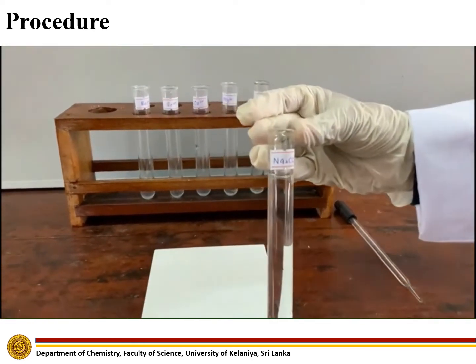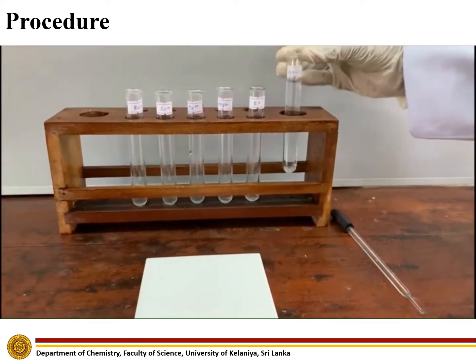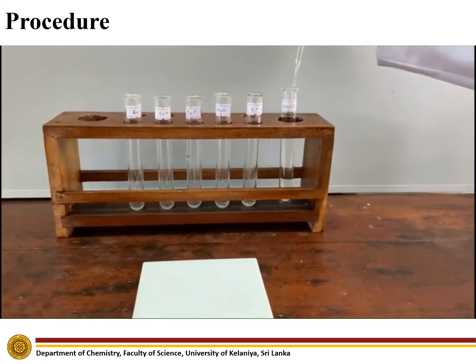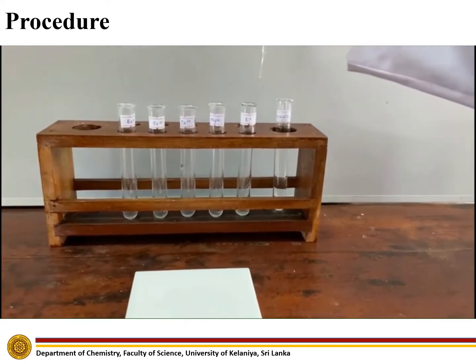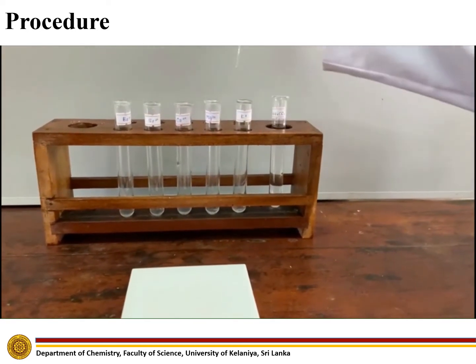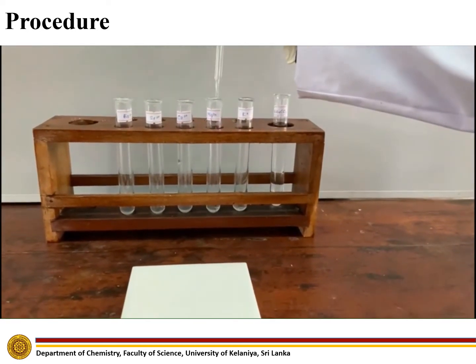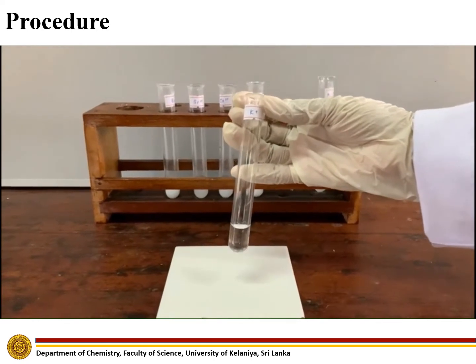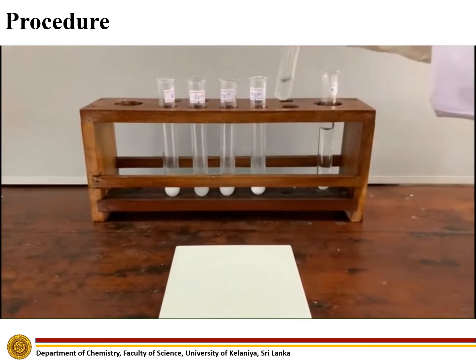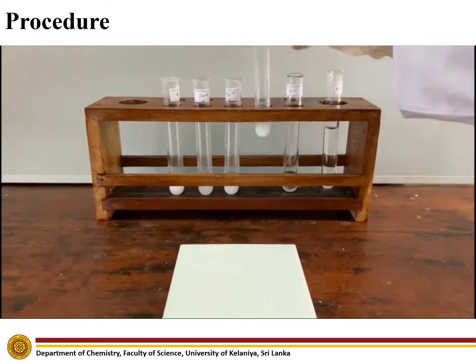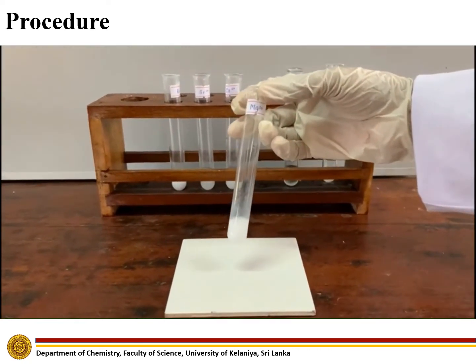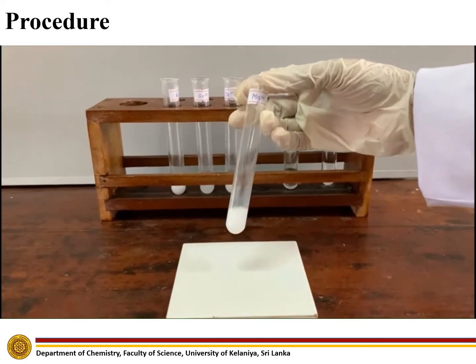Add sodium carbonate dropwise to the given cation solutions. It dissolves well in potassium ion solution.